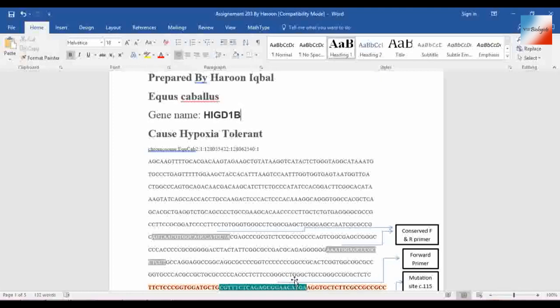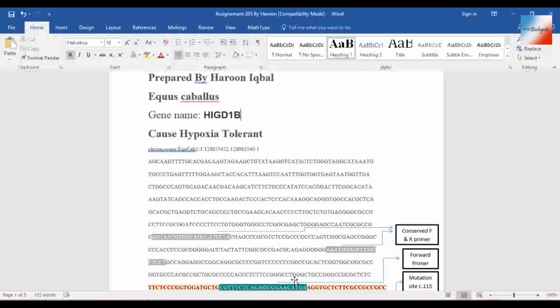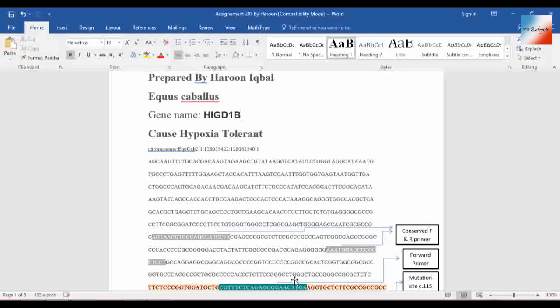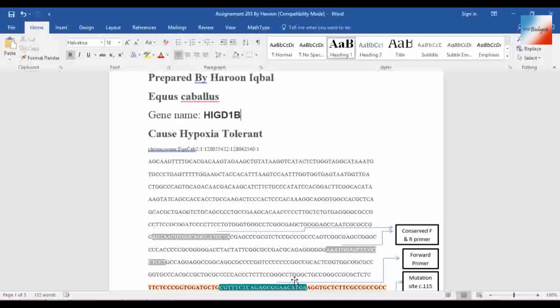We are looking for the mutation causing that gene which makes the disease occur. Let's see, first of all we need to know what we are looking for. This is my assignment on horse hypoxia, the oxygen consumption mechanism in horses.